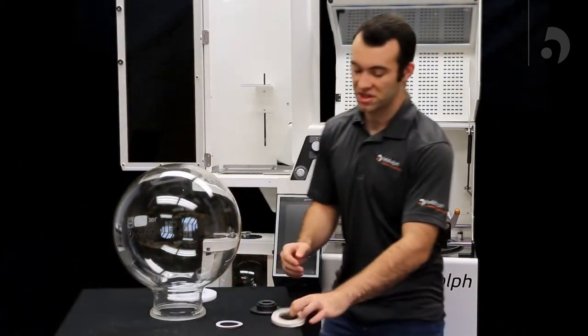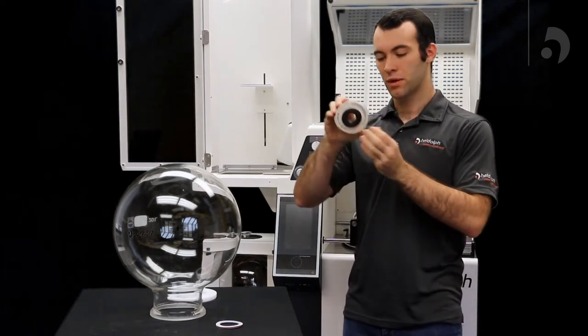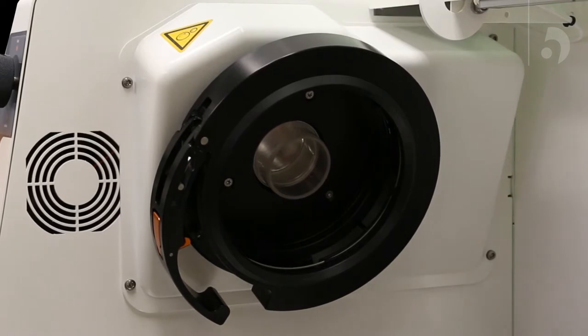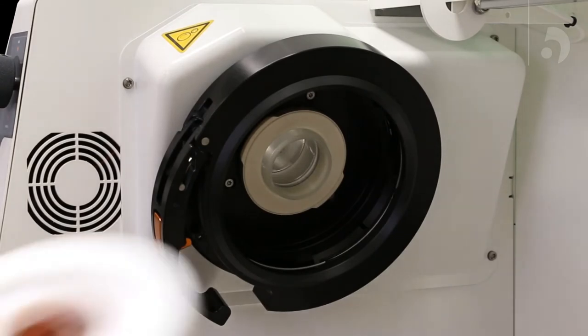From there, we can take our PTFE seal and our PTFE seal tool, combine them by pushing it through the back, and while holding the vapor tube, push the tool against the vapor tube, and then slide the seal onto the tube.